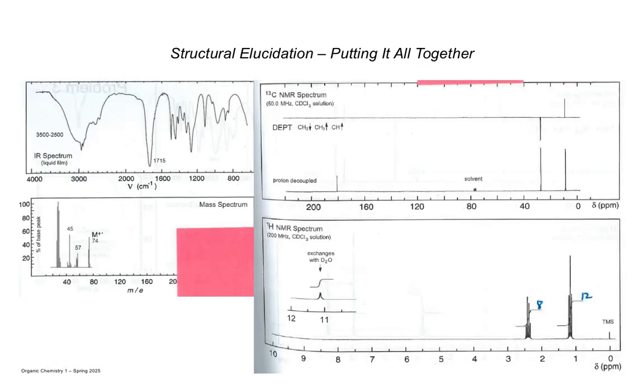So I thought we would start off. We've learned quite a bit so far. We've taken our Lewis dot structures. We've learned about functional groups. And so we've seen IR, mass spec, proton, and carbon NMR. I have a book that has about 200 of these problems, so I screen grabbed the data from one of those problems, and we'll walk through it.